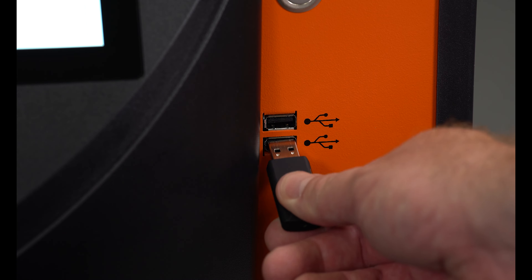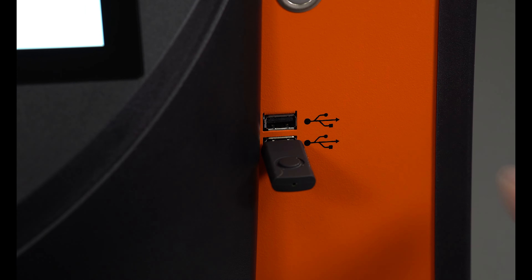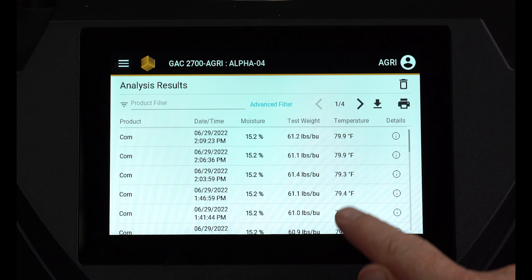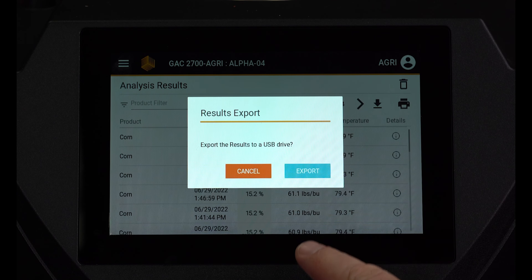To download the results to a USB memory device, press the arrow icon.